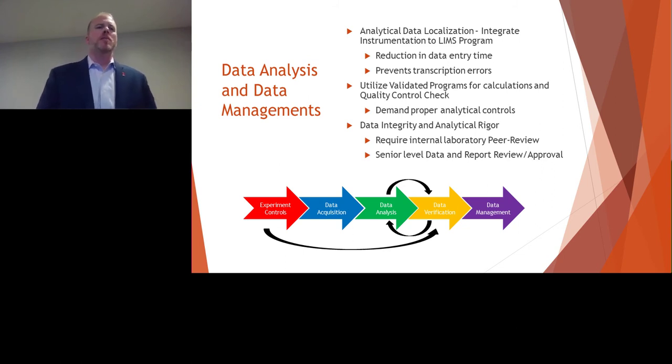So the next component that you really want to look at, once you go from method development, getting your lab up and running, samples start coming in, and you're producing data, is your data analysis and your data management. Analytical labs produce a ton of data, and being able to track that data, analyze it, and keep it in an organized manner is really important for an analytical laboratory.